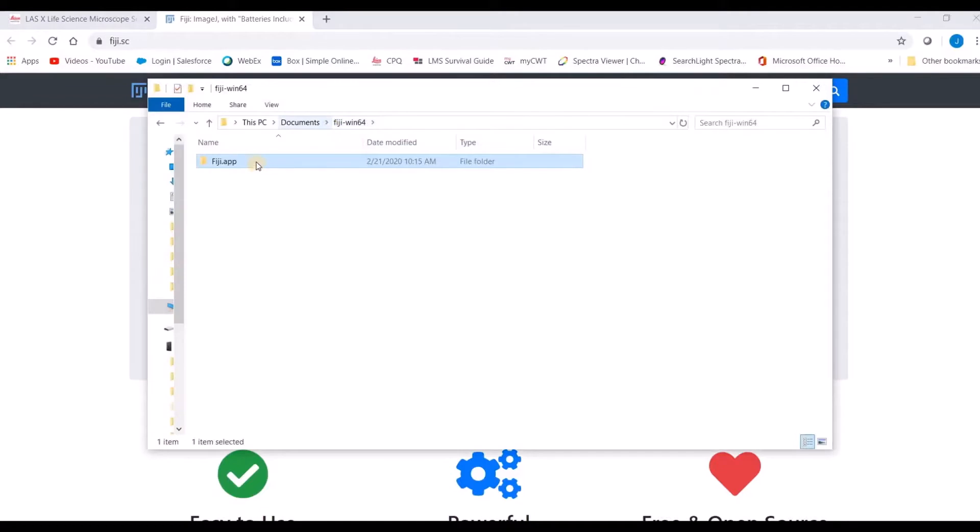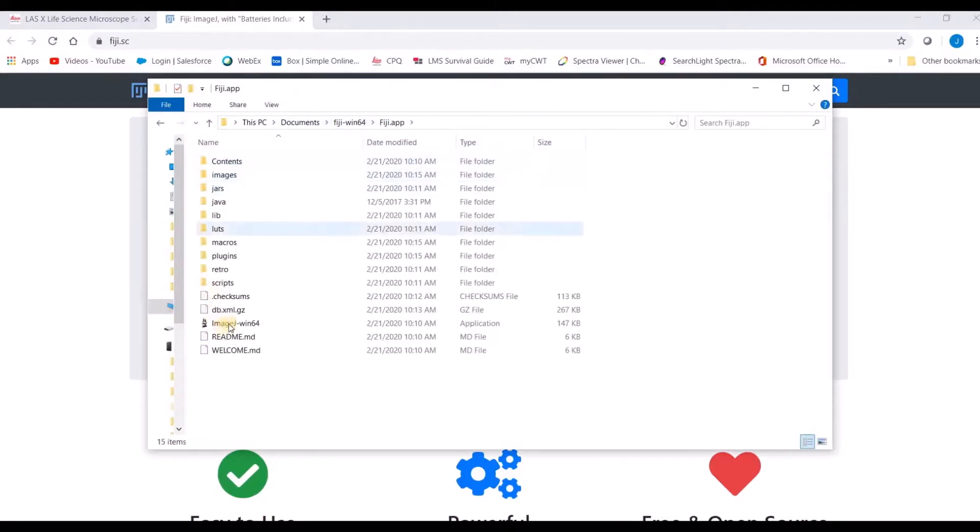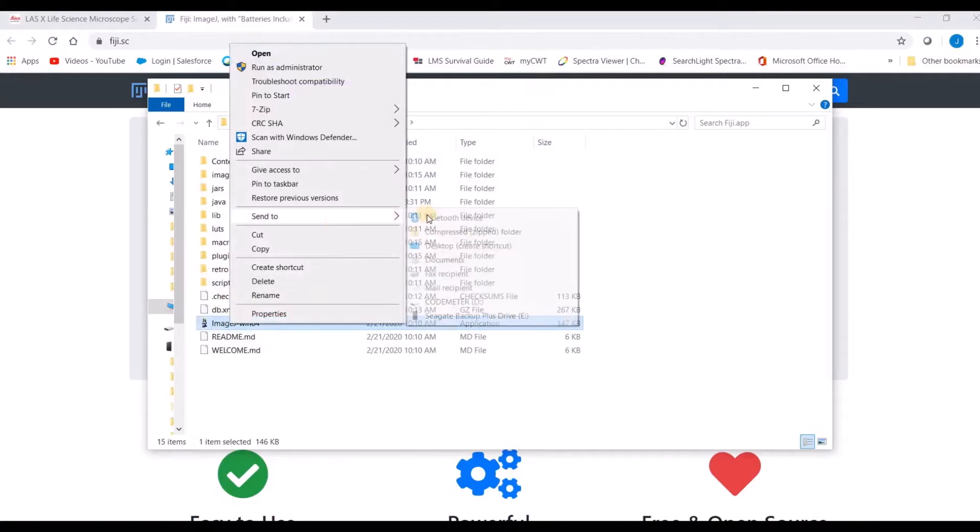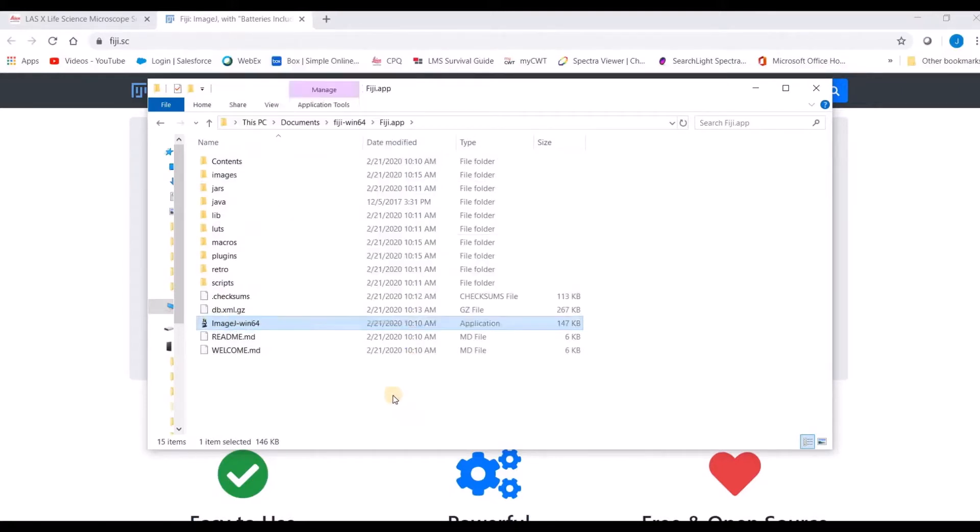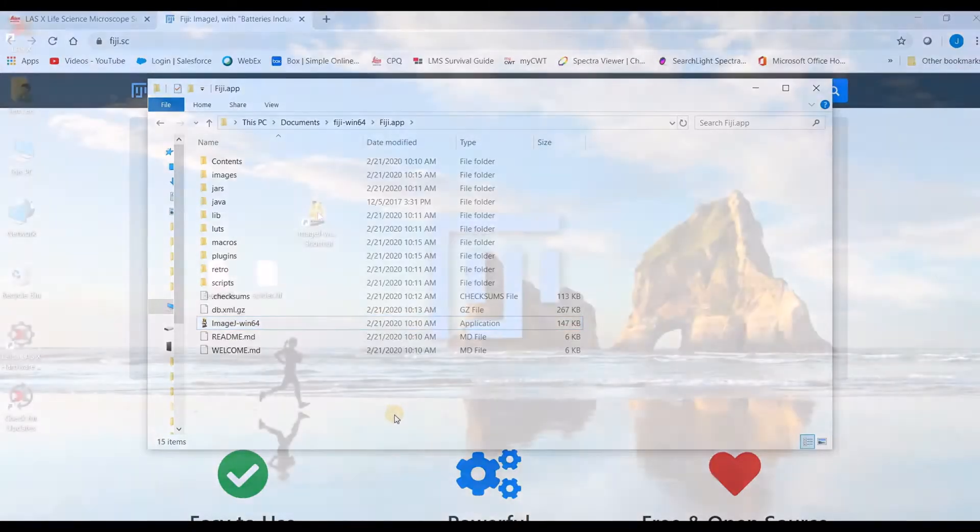Go ahead and drag your Fiji app folder to documents. And then in that folder, go ahead and send a shortcut of the application to your desktop for easier navigation.